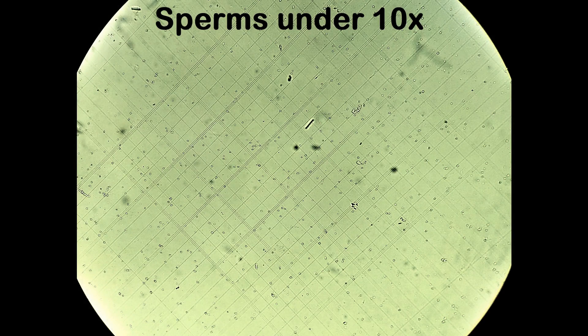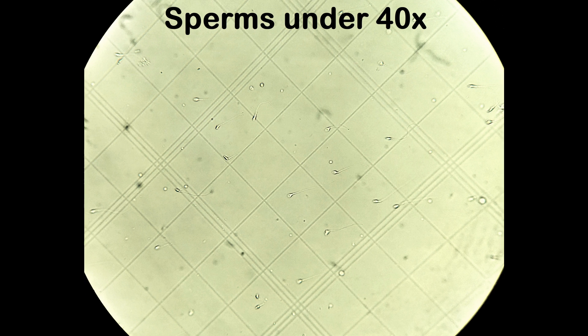You can also check out my video on the hemocytometer — click on the link in the video screen and it will take you there. This is how sperm cells will appear within the small squares of the counting chamber. Repeat the counting process in the second counting grid of the counting chamber as well.